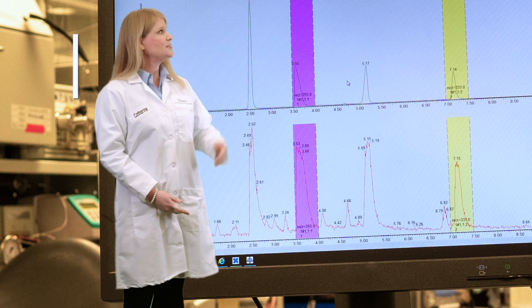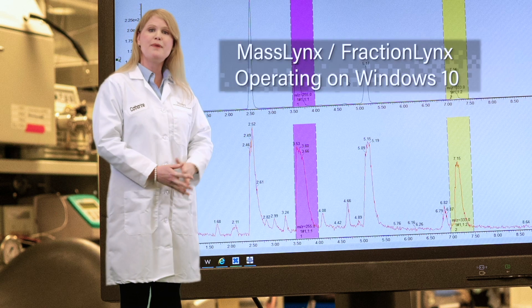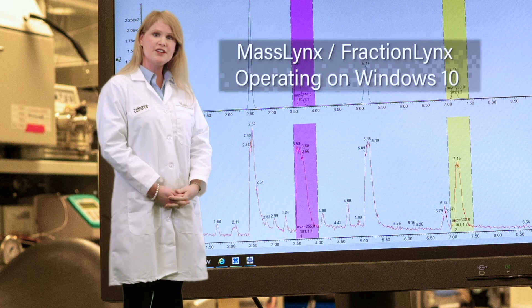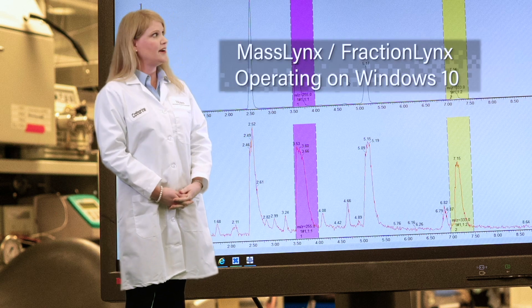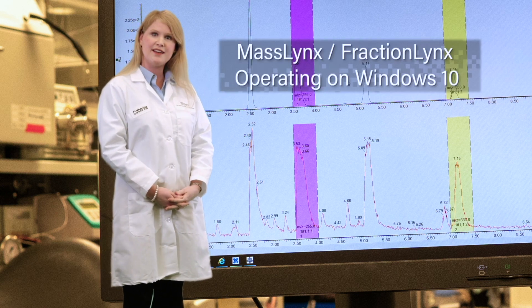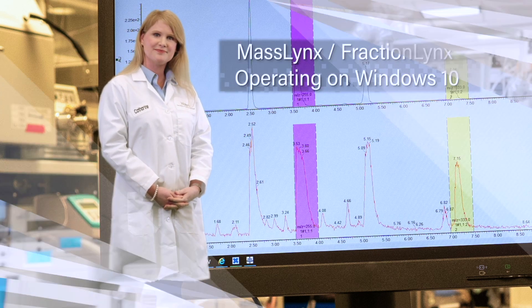Finally, the system is controlled by MassLinks FractionLinks operating on Windows 10. Thank you for listening. For further information, please visit the Waters website at waters.com/SFC150.